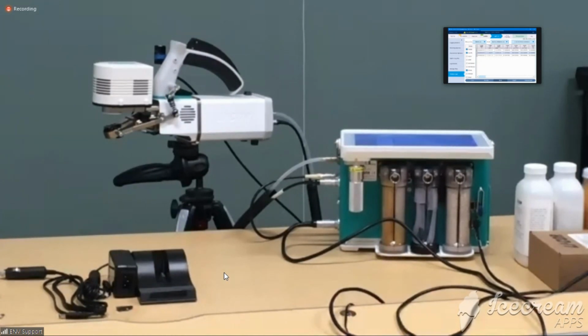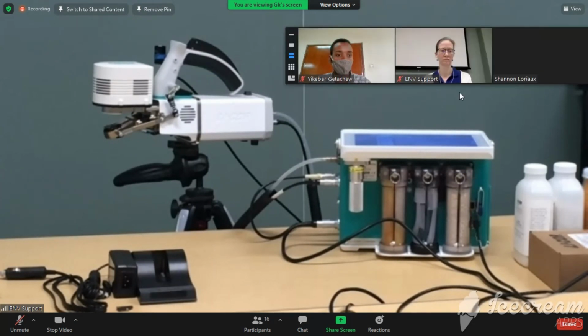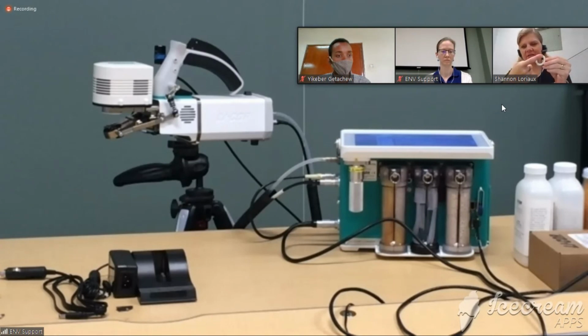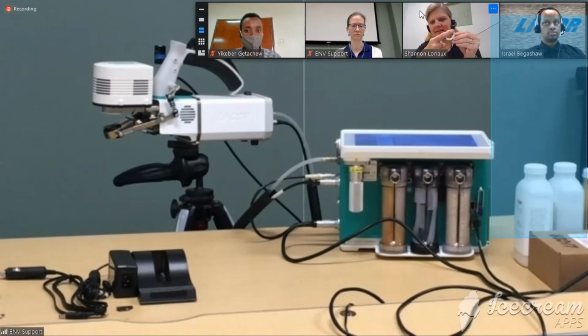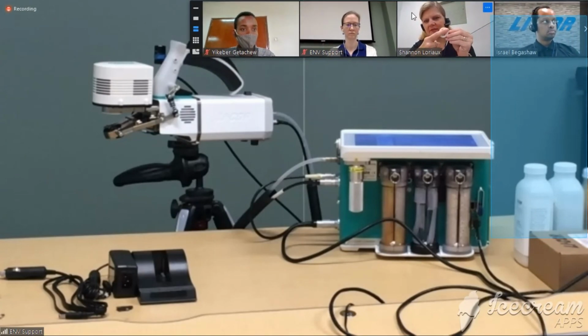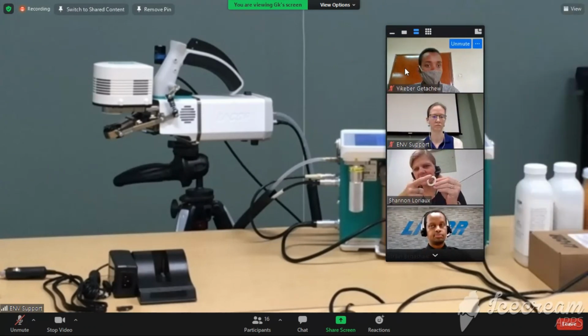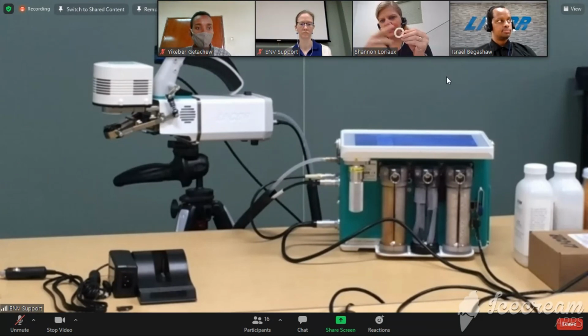So this is just the aperture of the fluorometer chamber. I just took it out. What I would recommend doing is you can put a little bit of double stick tape and basically lay your leaves right next to each other. And the double stick tape will keep the leaves in place while you put in your other leaves. So you can put them side by side in the chamber before you clamp down, and then you'll fill the aperture.